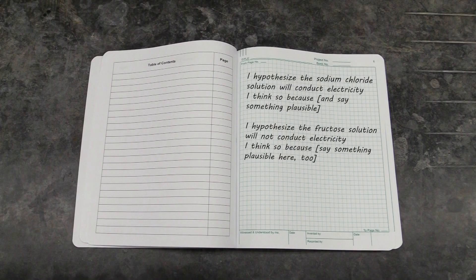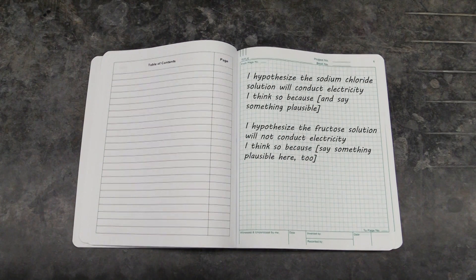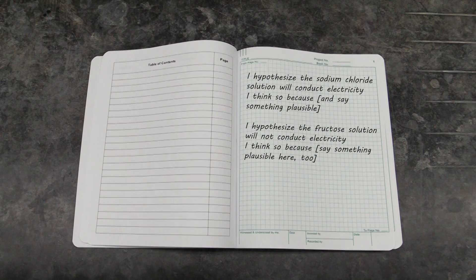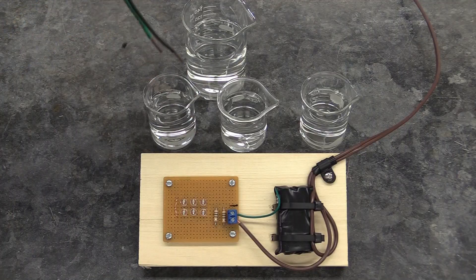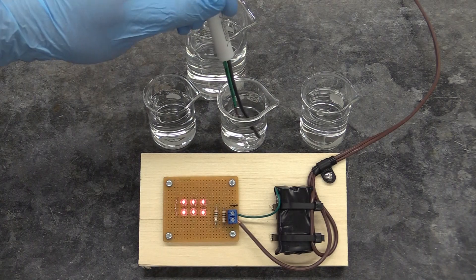Before you come to lab, you will need to hypothesize which of the solutions you'll be given should conduct electricity and which should not. As you're performing your tests, make sure to rinse the lamp's probe in DI water between solutions. If you don't, you'll contaminate them.